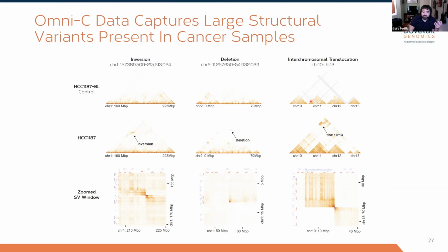And then the nice thing about this is you could zoom in on these SVs and start looking at what the gene landscape is around these regions. Or conversely, like I said earlier, you could reassemble and look at the topology de novo for these cell lines, right? And then do a genome-to-genome comparison to a normal. So, all right, that is another powerful data type here where we're allowing you to capture those single nucleotide polymorphisms, and we're allowing you to capture these large structural variants.